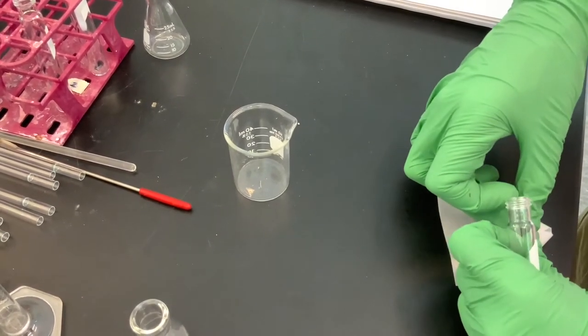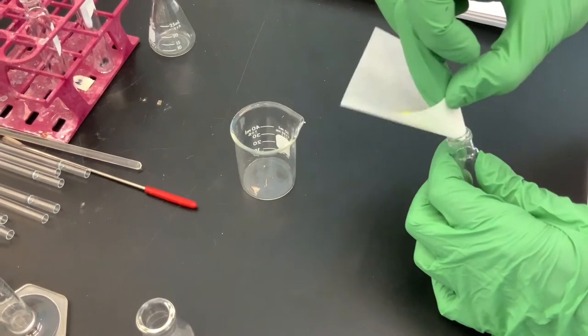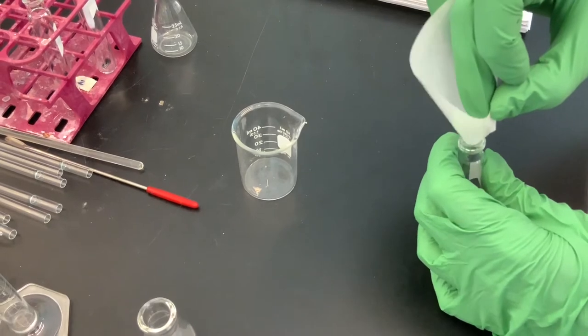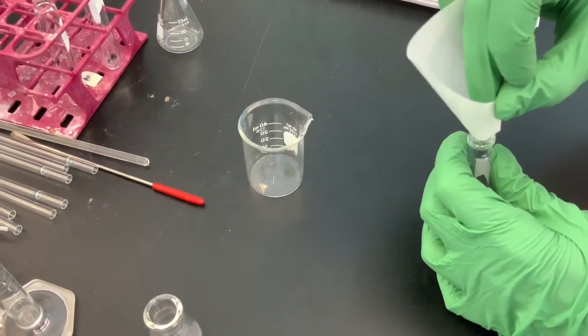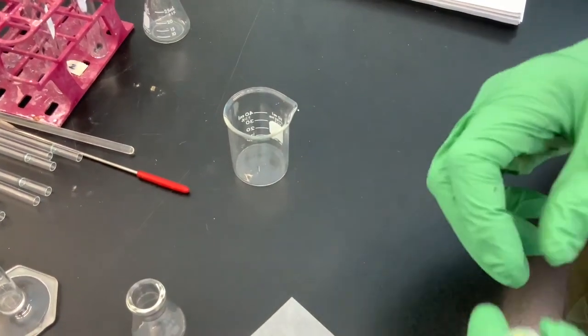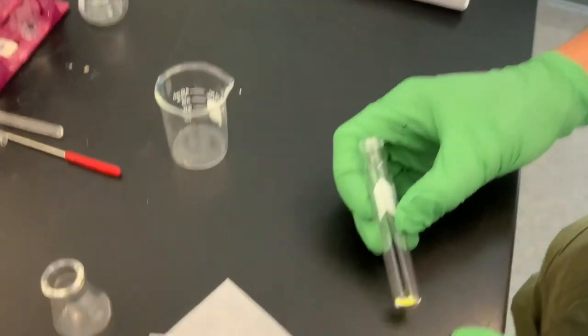And our organic solvent is methylene chloride, aka dichloromethane. And so this halogenated organic solvent will always be on the bottom layer. It is more dense than water. Its density is 1.33. So now you can see we've got our 3 compounds mixed in there, so you can even swirl it around, right?